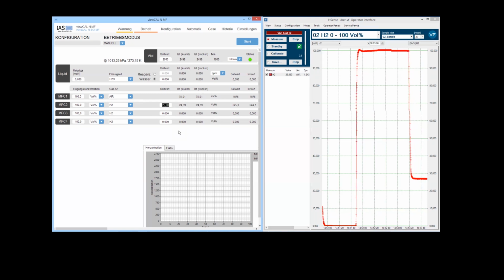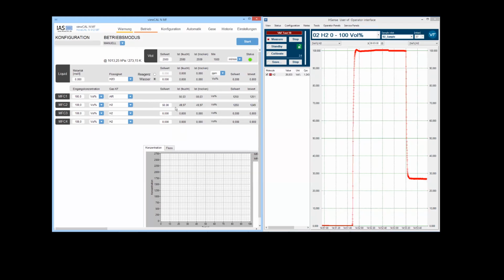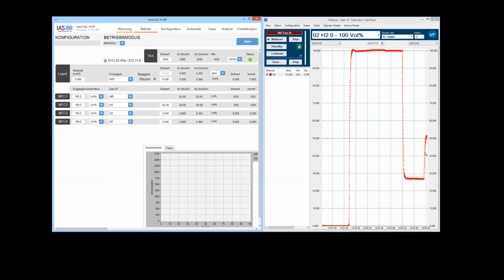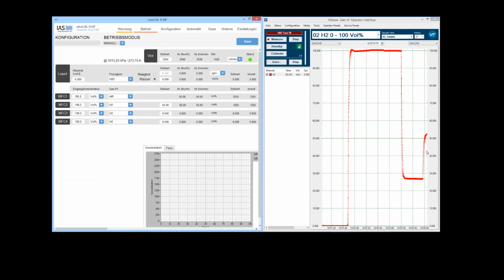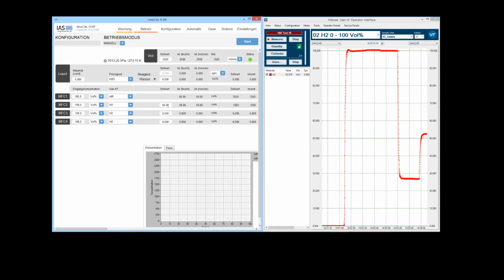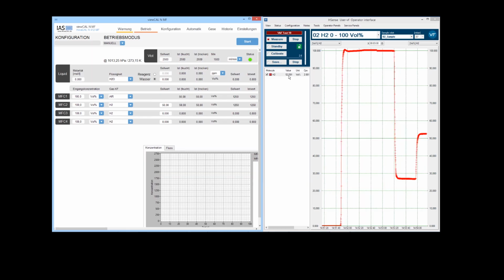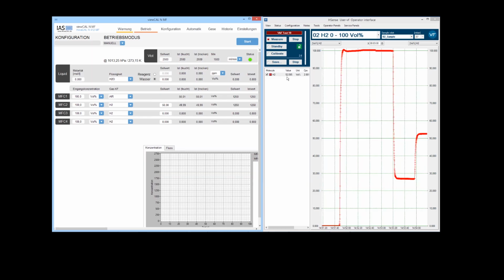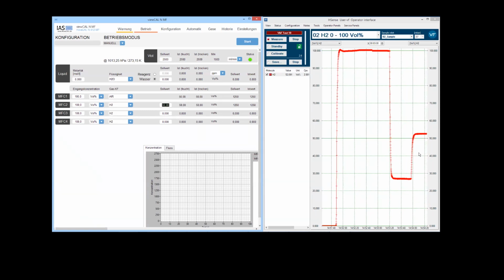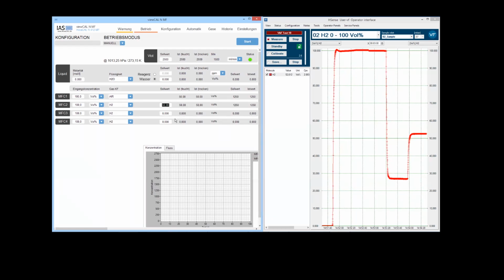In order to recheck that, we can also try on another concentration, for example, 50 volume%. So here again, we see that currently the instrument is not displaying the set value that is given by the gas divider unit. So we are roughly 5% over the set value by showing 52.5 instead of 50. This would, for example, give an indication that a complete relinearization of this method is necessary.